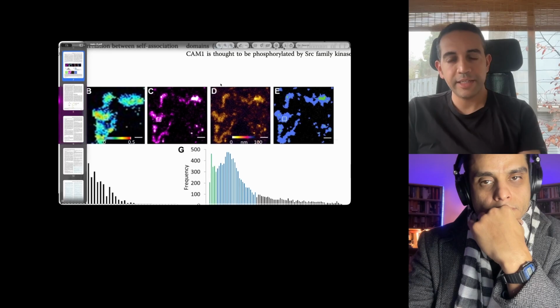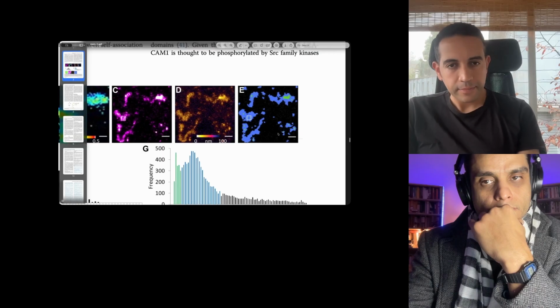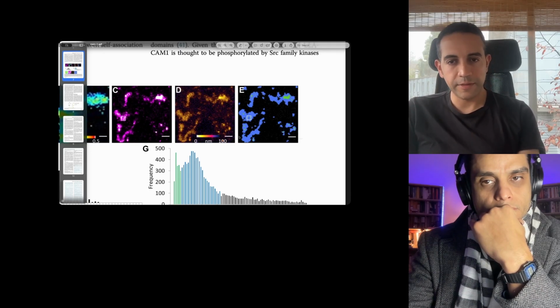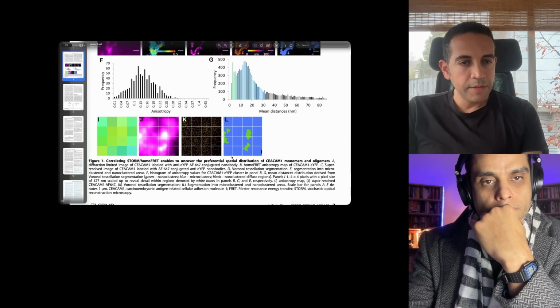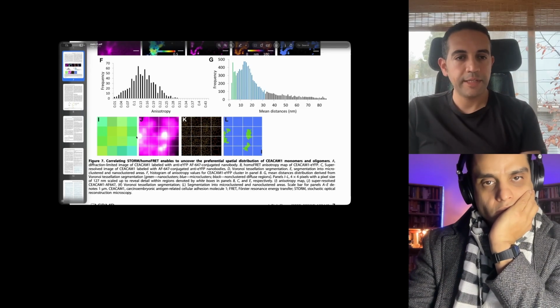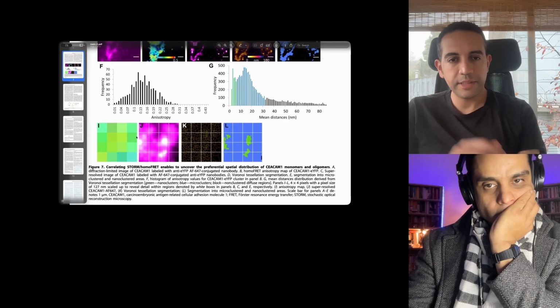And in D, you have again that cluster analysis method that I became very fond of, the Voronoi tessellation. From that, you can extract sub-features like smaller, dense clusters. So you have bigger clusters in blue, and you have smaller ones in green that we call nanoclusters in this paper. And then if you go down to the bottom part of this figure, you'll see that, for example, this region that has this distribution, which is pre-oligomeric or pre-dimeric, has this set of nanoclusters and whatnot.